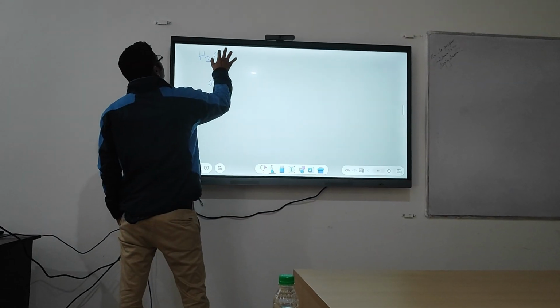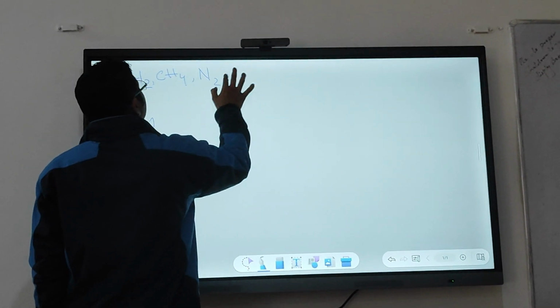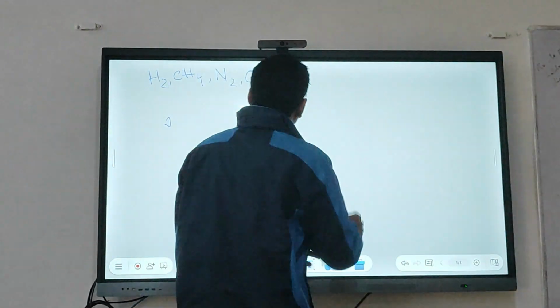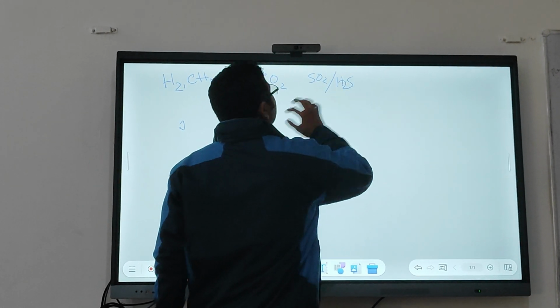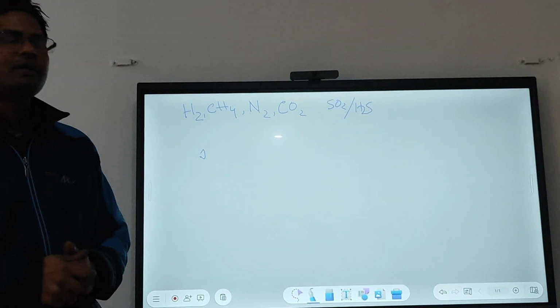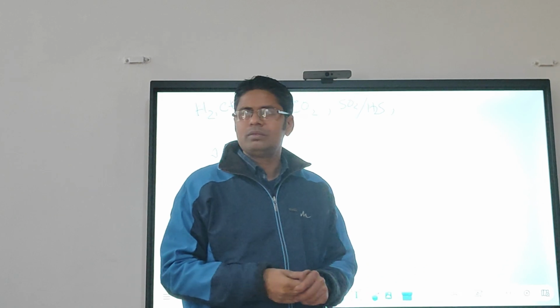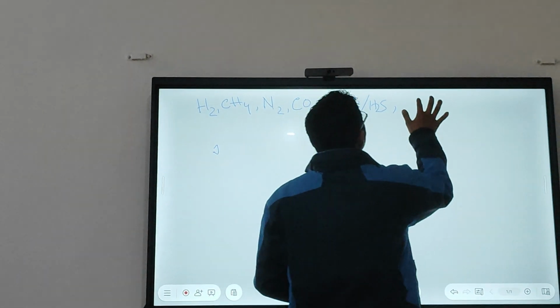Methane, nitrogen, CO2, any other? SO2. SO2, even H2S is also there. They have some sulfur smell, right? Methane. Sometimes, because it is collected from natural resources, you may get a very small amount of oxygen also.